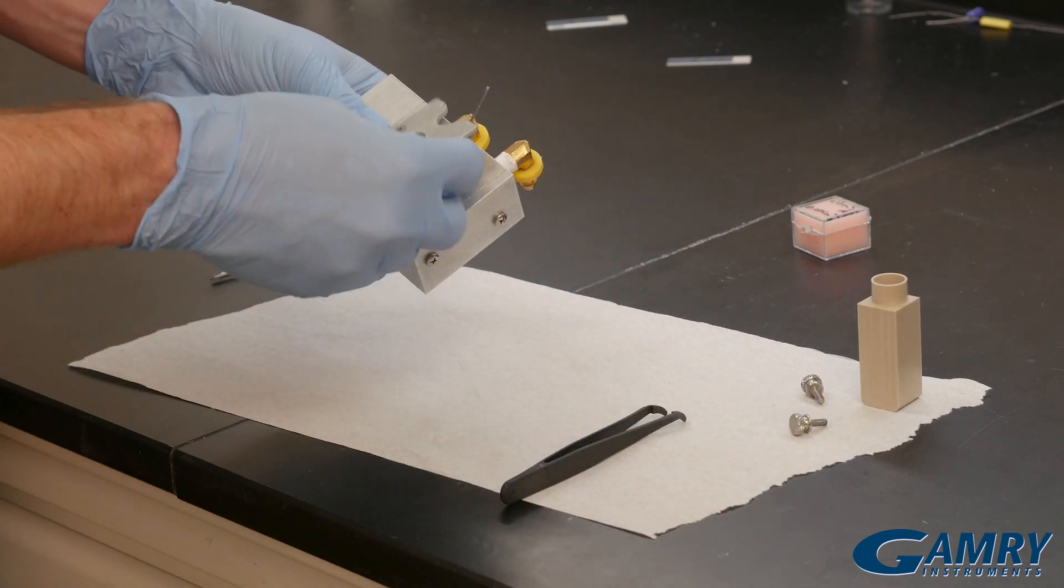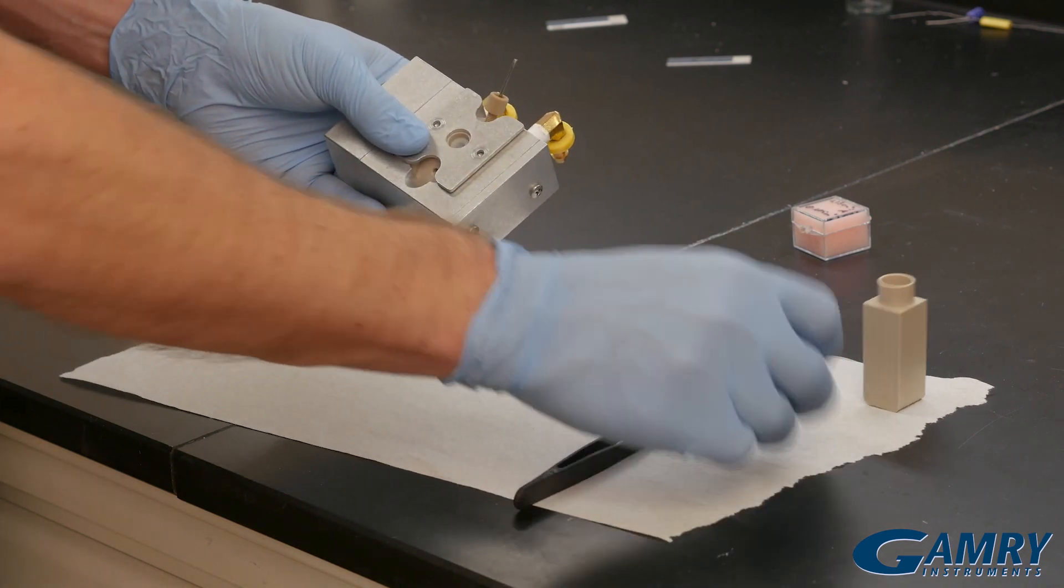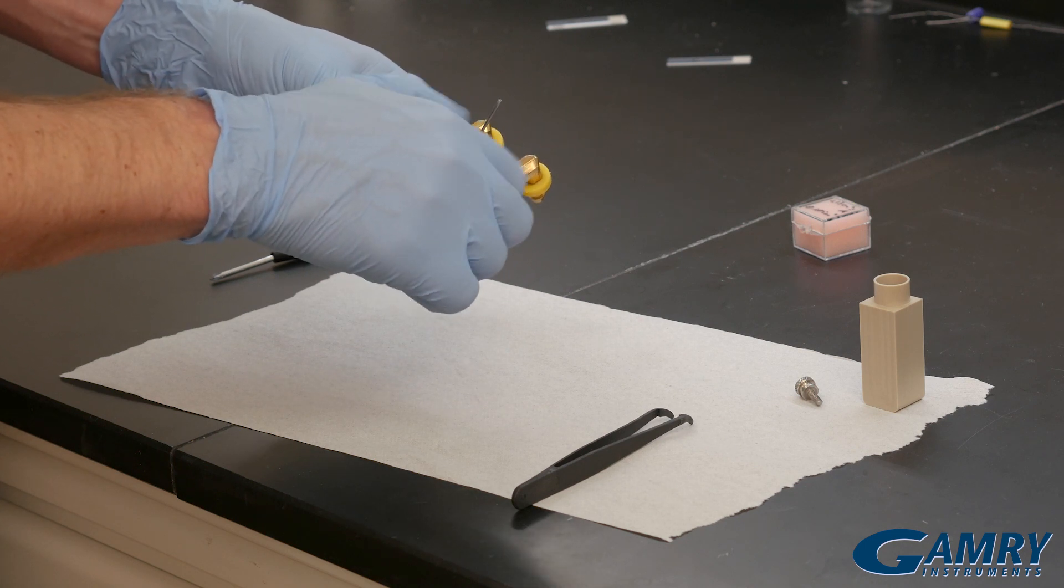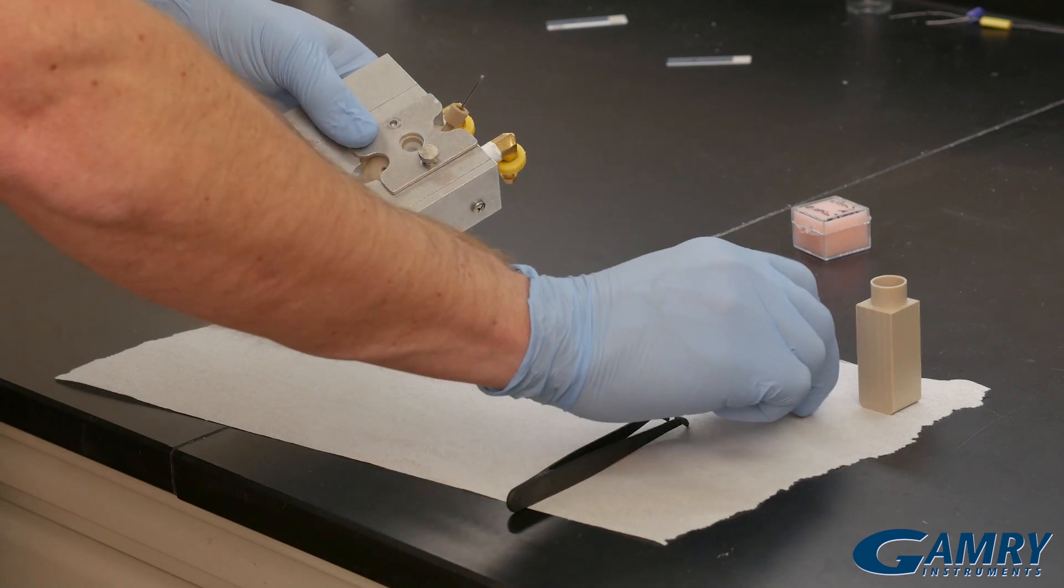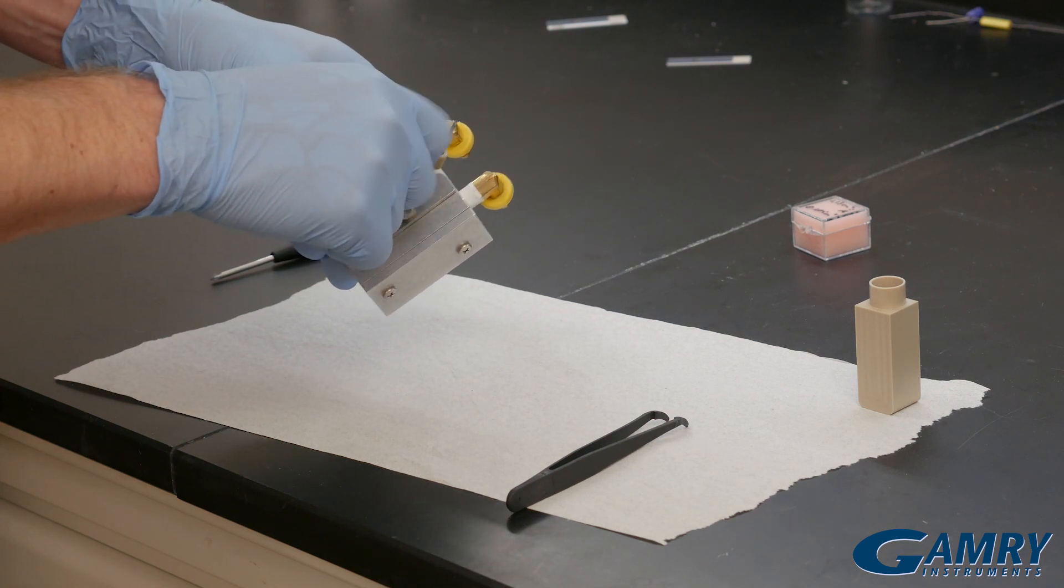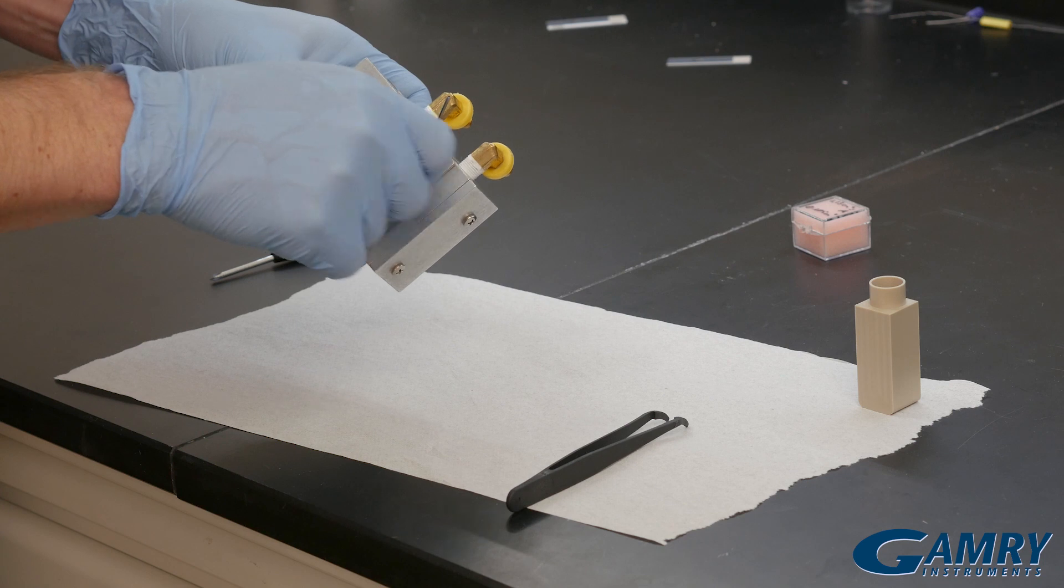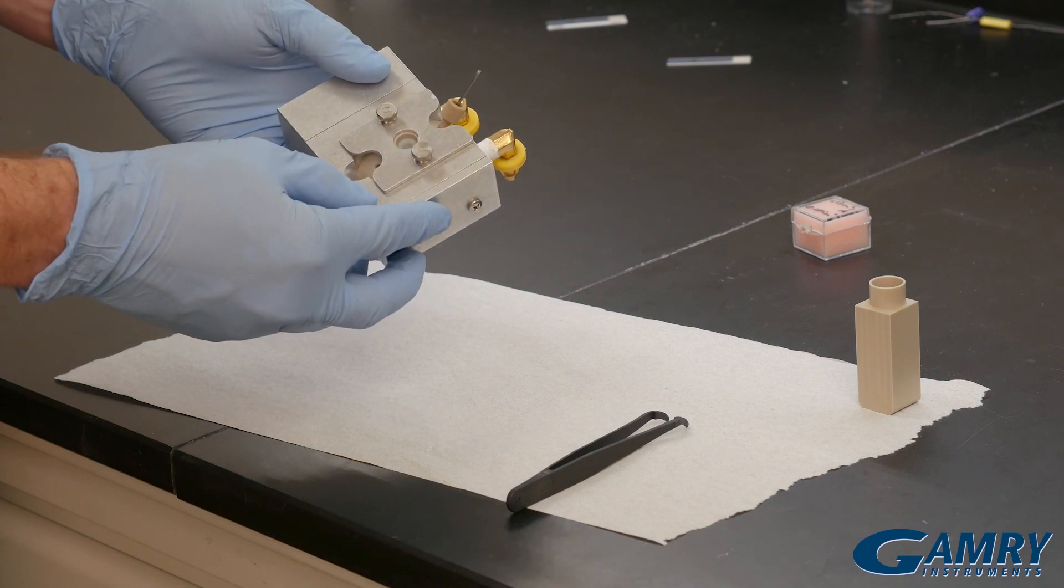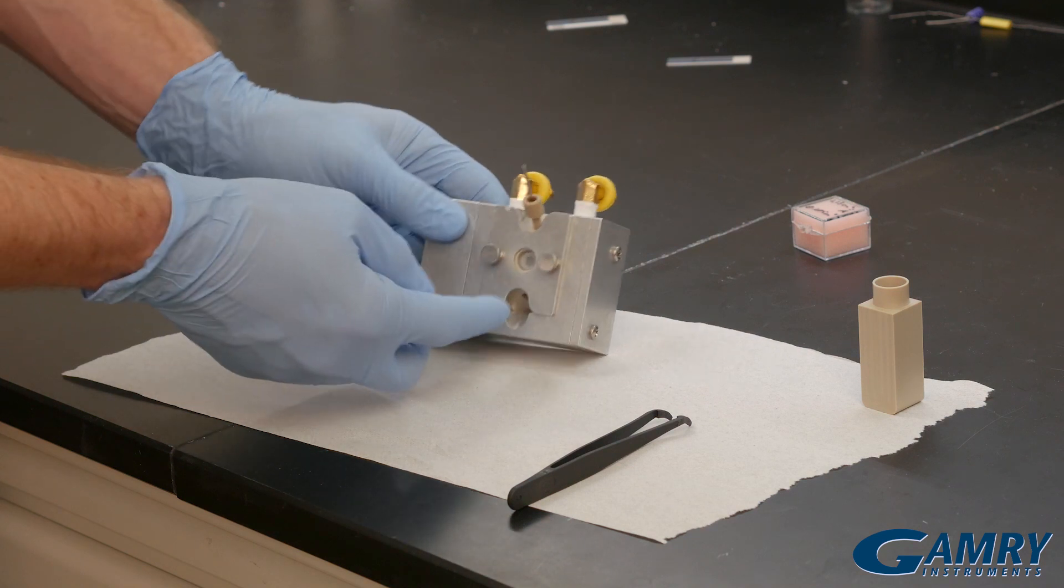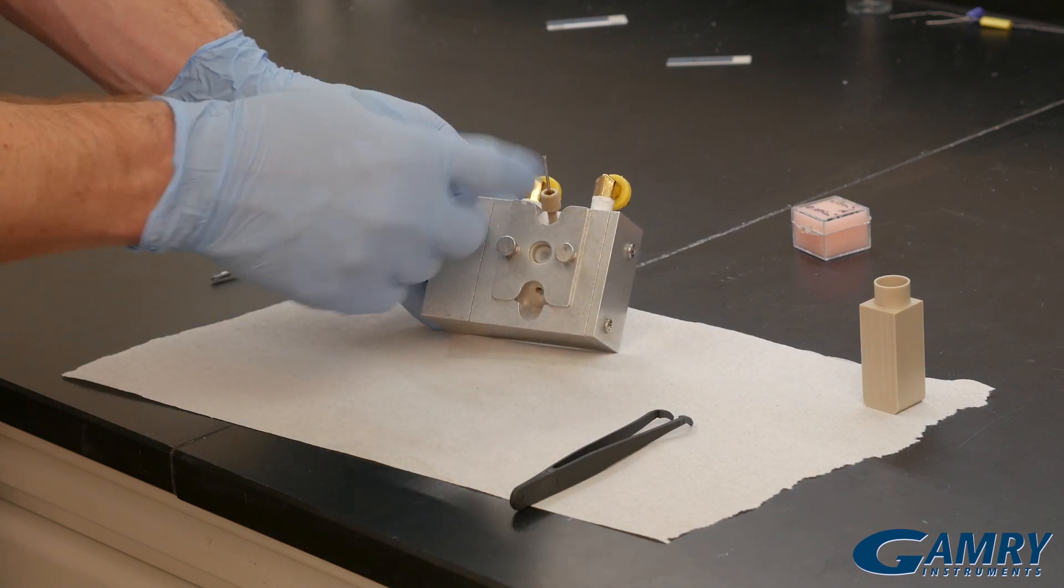So the flow module fits in right in the same place. Again we can use our capture plate to hold the flow module on. We tighten everything down using the thumb screws, and next we're ready to connect our tubing to the inlet and the outlet.